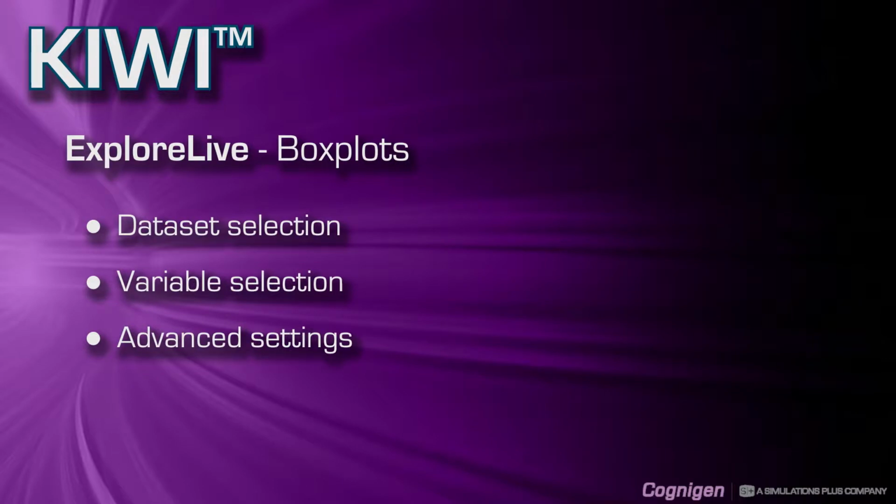Hello and welcome. In this video tutorial, I will demonstrate how you can create box plots in the KIWI ExploreLive module. I will illustrate the use of basic settings, such as the selection of your data source, selection of the variables that are displayed on the box plot. I will also illustrate the use of more advanced settings.